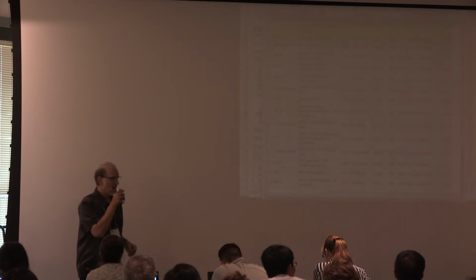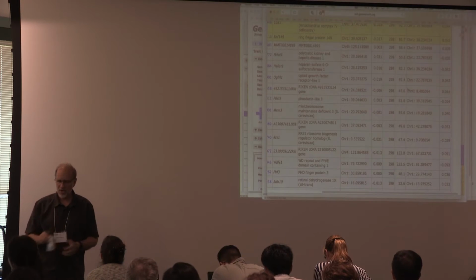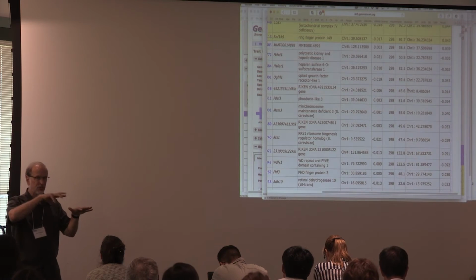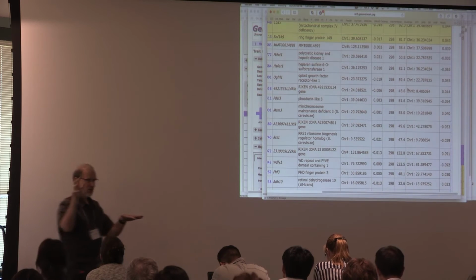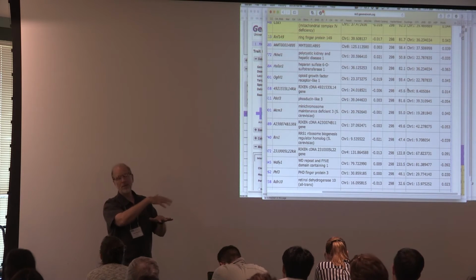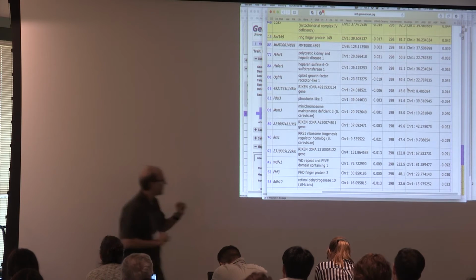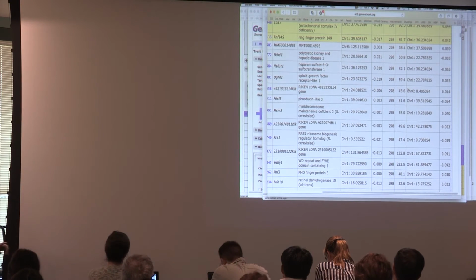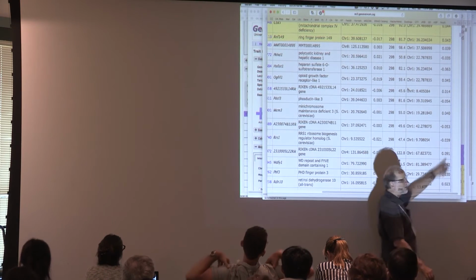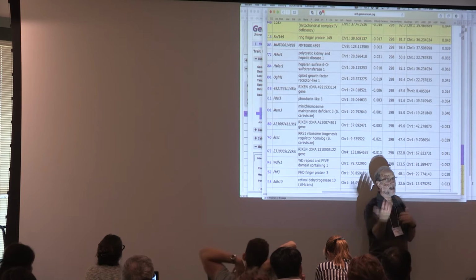So back to Peter's question about artifacts. Because you're aligning against a reference genome, and what you're aligning to the reference genome may not be reference at all, you'll end up with hybridization that's poor for one genotype and good for the other genotype or haplotype. And you'll see an asymmetry of effect direction. In GeneNetwork, we keep track of the effect direction over here, the minuses and the pluses, and you can look and see whether across the whole data set it's balanced or not.